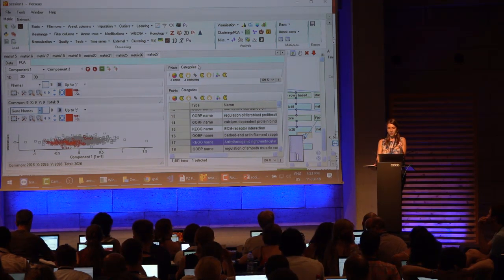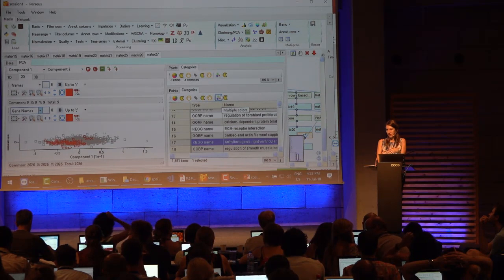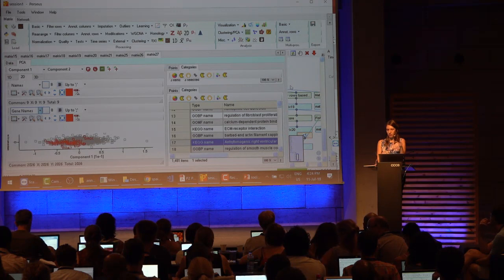Now, if this is not possible, you can do it at different levels of the analysis, and actually you have to do it before you start any statistical analysis. So standard ways are what Tommy showed, like just subtracting the median value from all of the samples. That is already going to help.